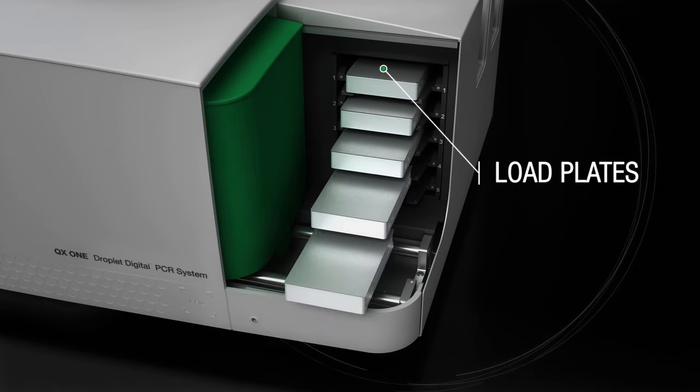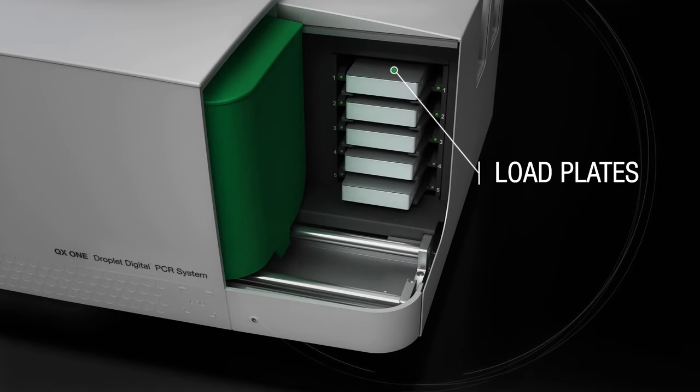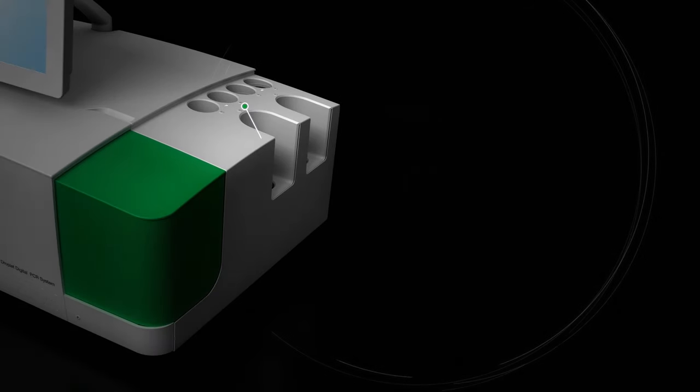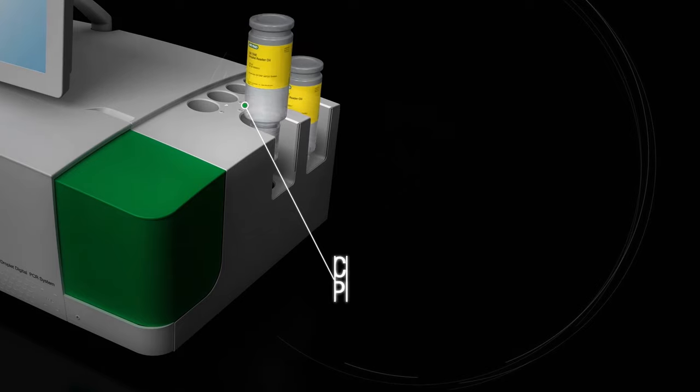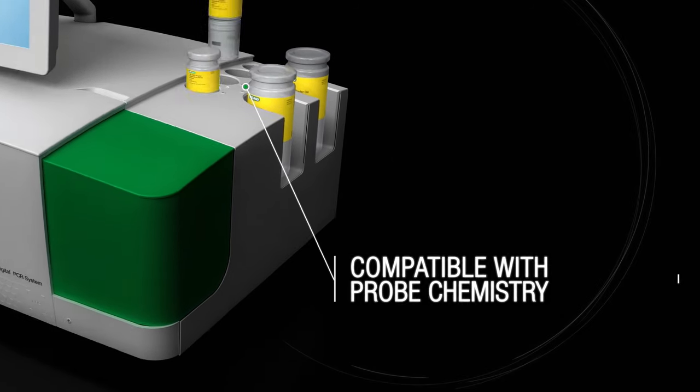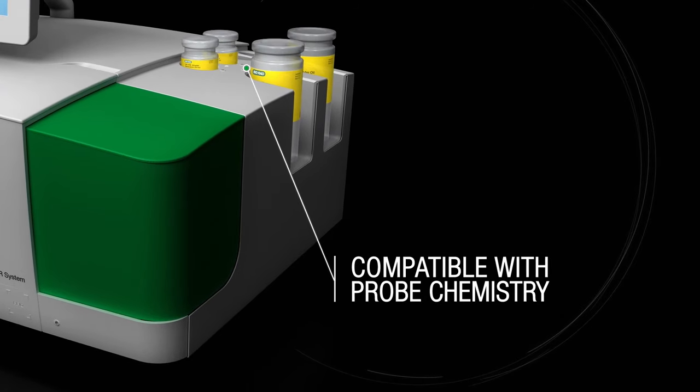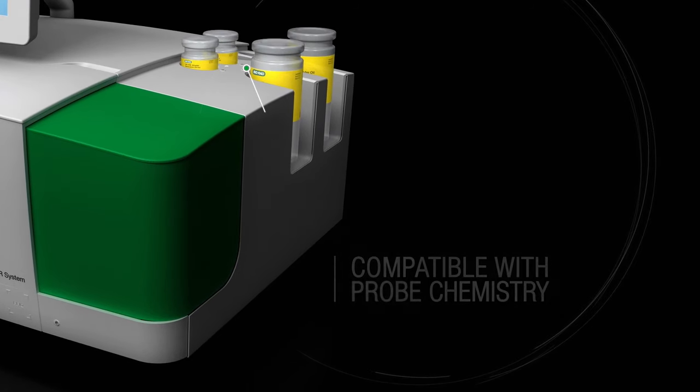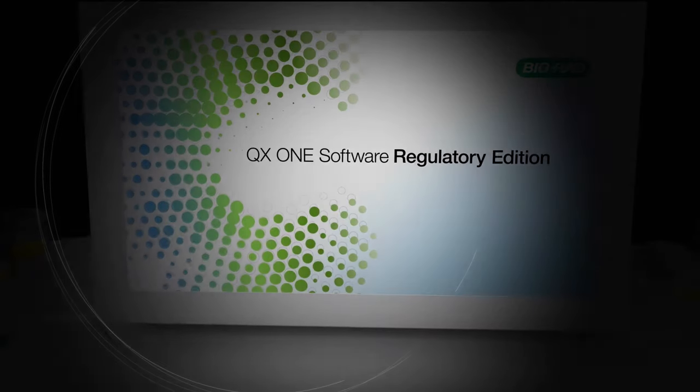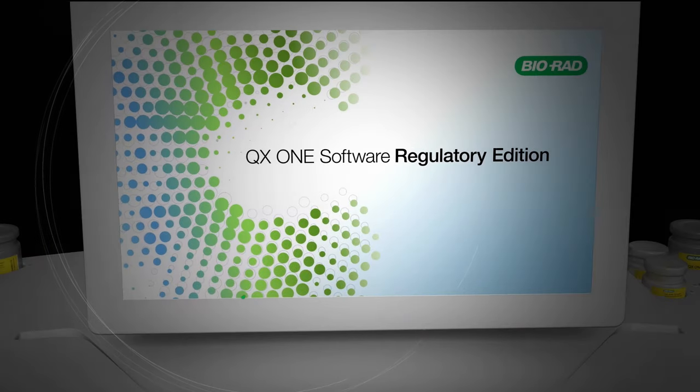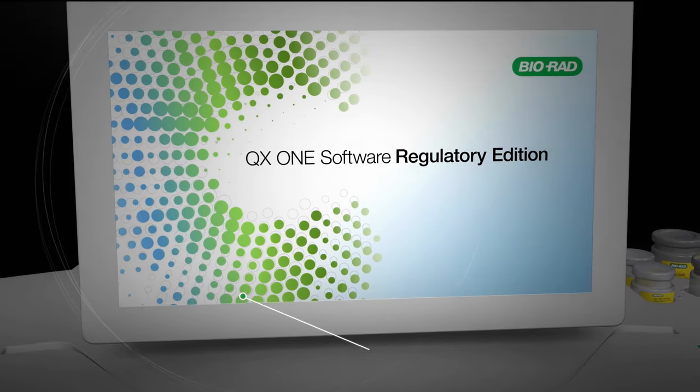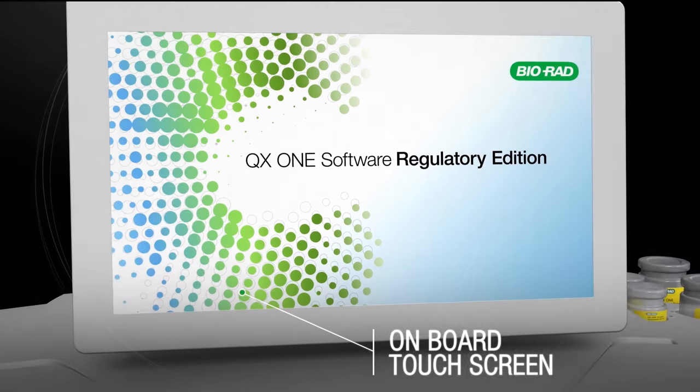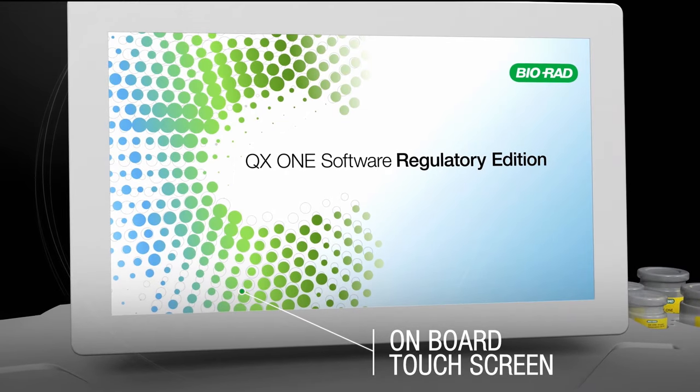Load up to five plates. Oil bottles are loaded and consumption is monitored by the system. Experimental setup and data analysis can all be done using the onboard touch screen.